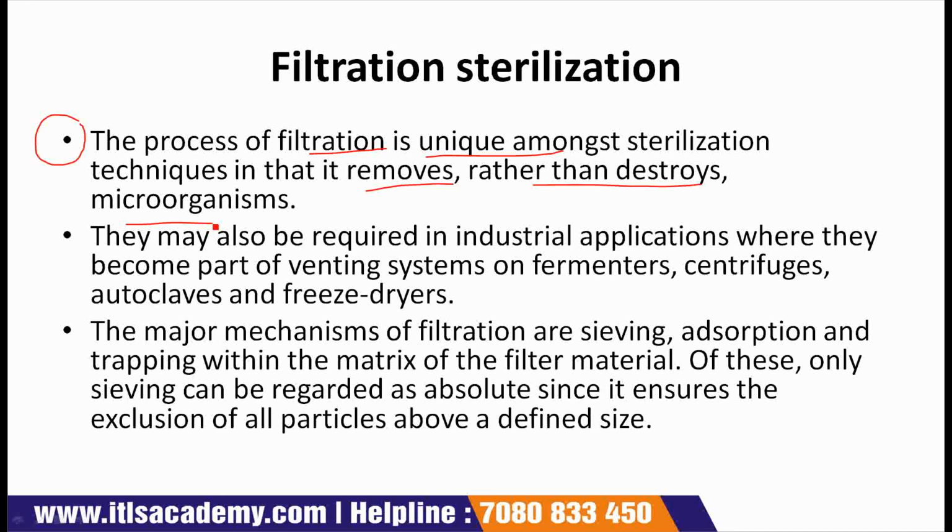The process of filtration does not kill microorganisms, it removes them by filter. The principal application of sterilizing grade filters are the treatment of heat sensitive injections and ophthalmic solutions, biological products and air and other gases for supply to aseptic areas.